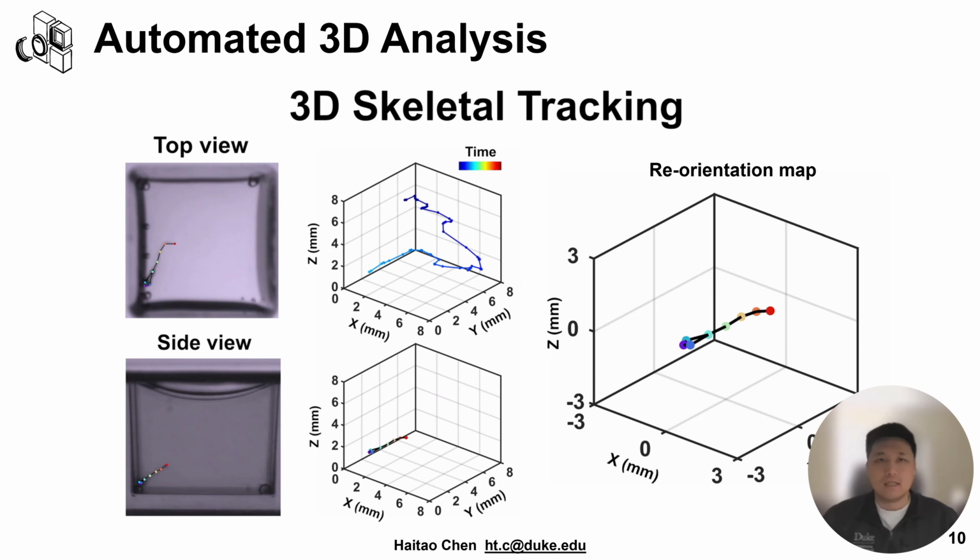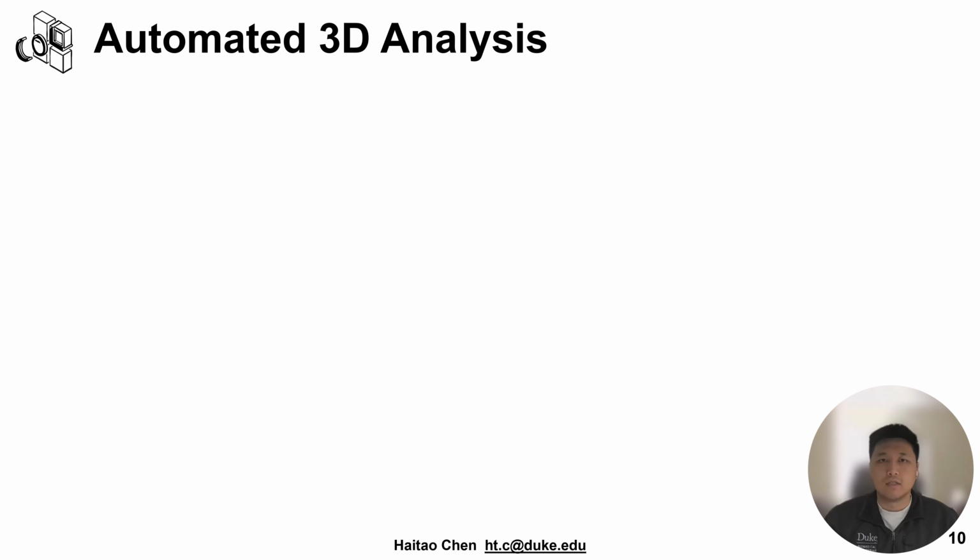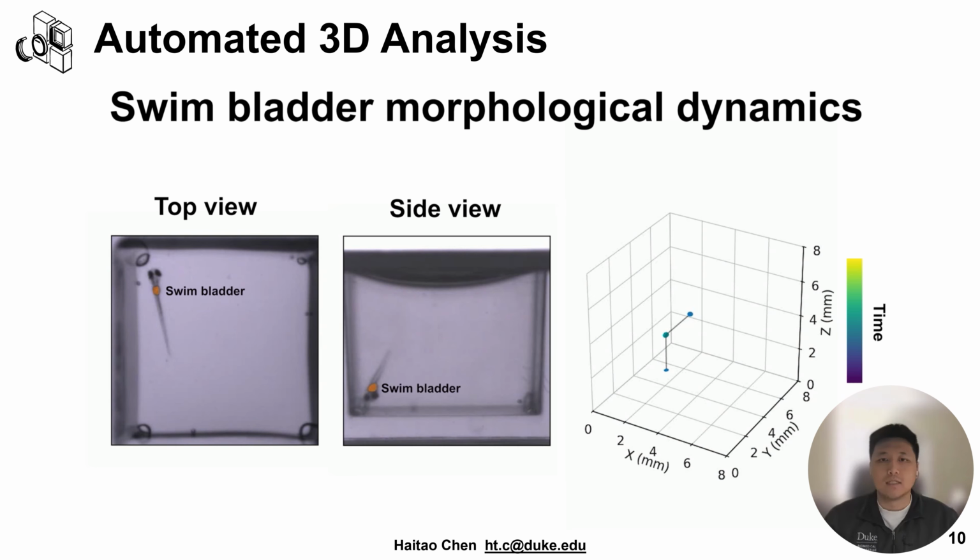Both pipelines are fully automated and scalable, allowing us to process dozens of larvae in parallel with minimal manual intervention. Here we show the segmentation of the swim bladder and its 3D reconstruction.